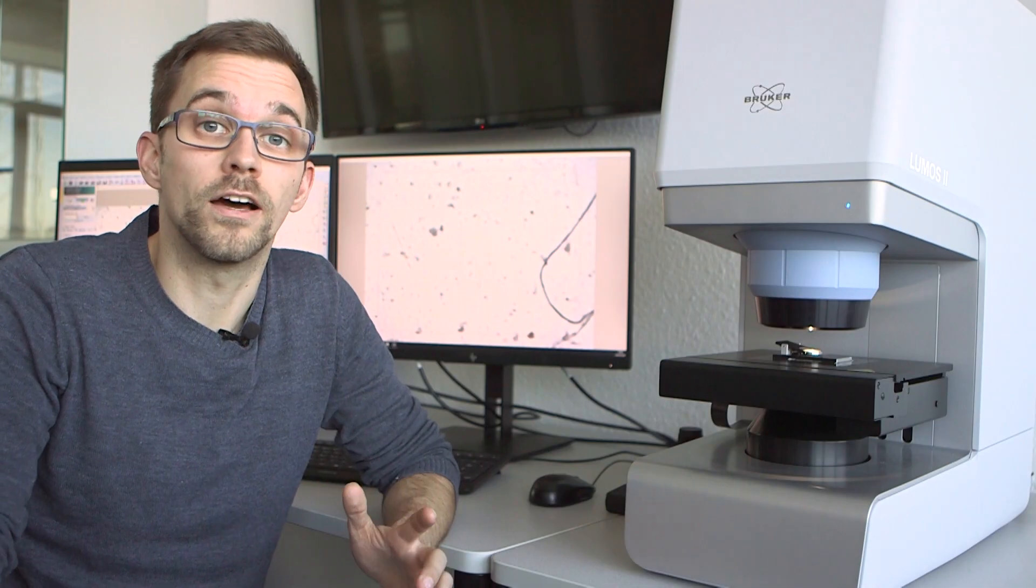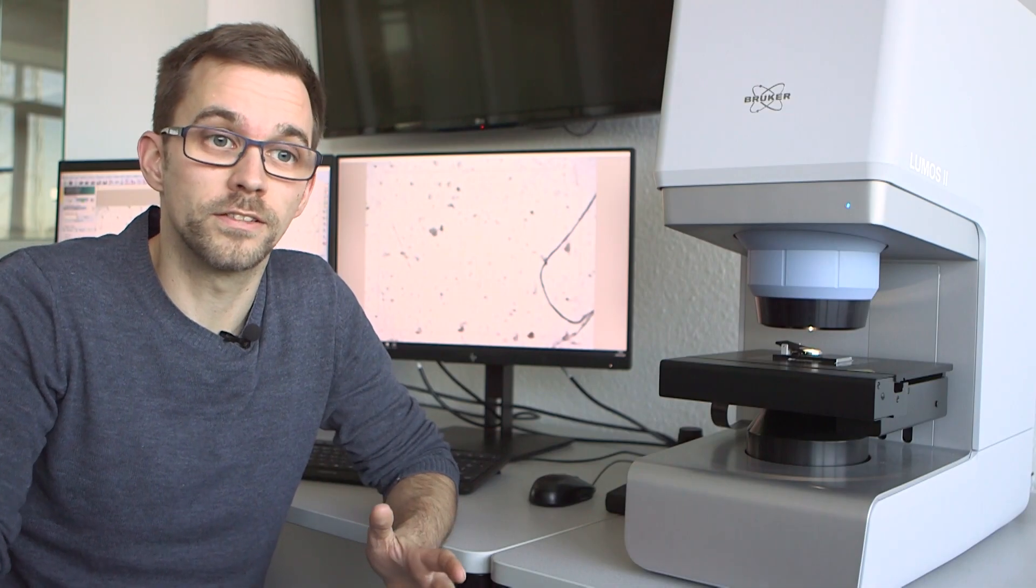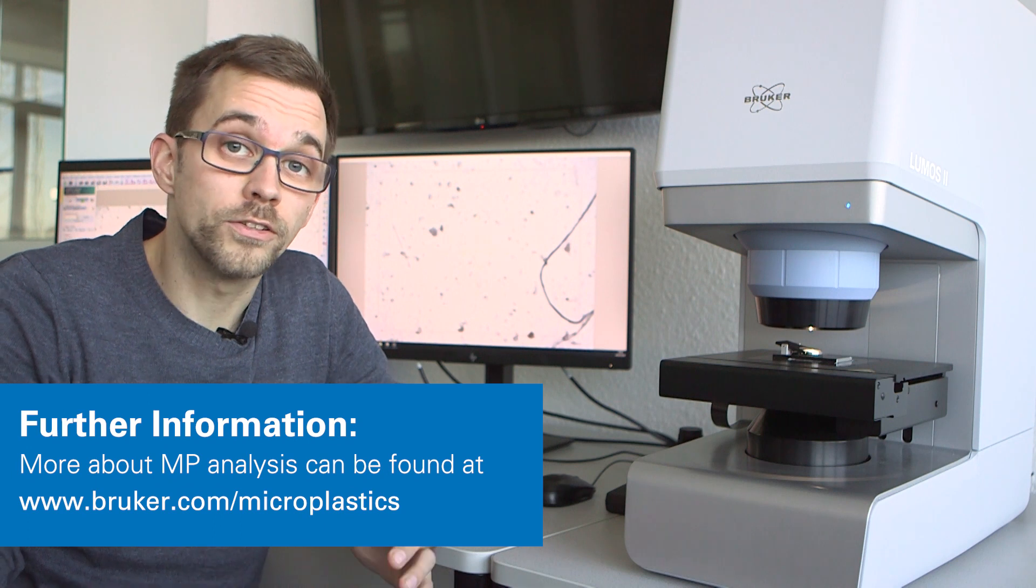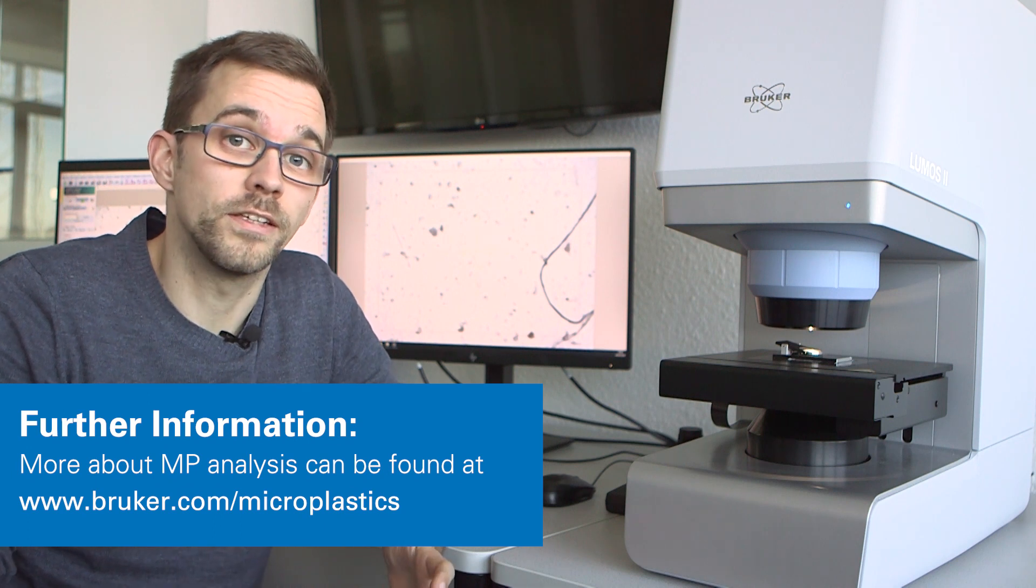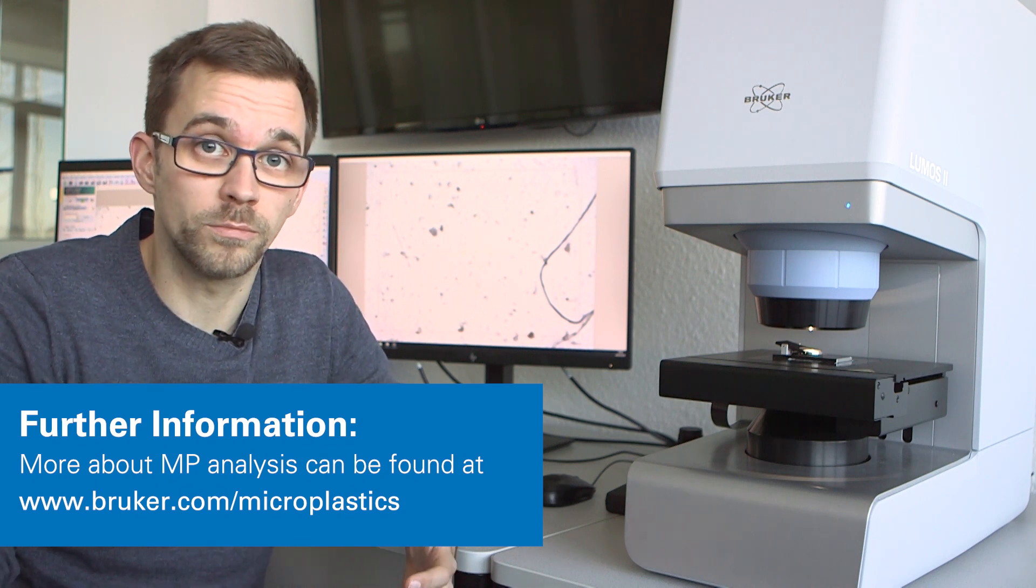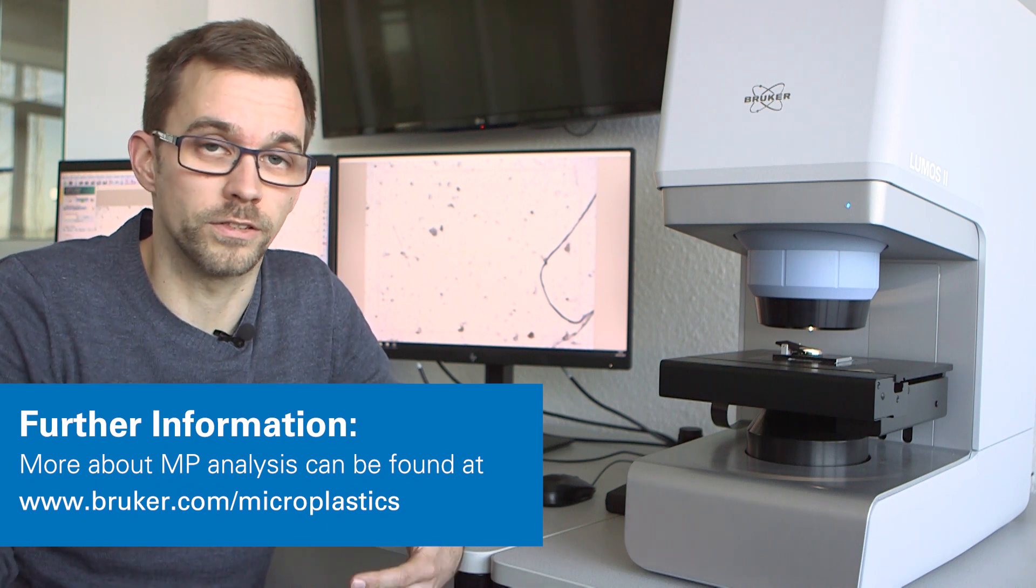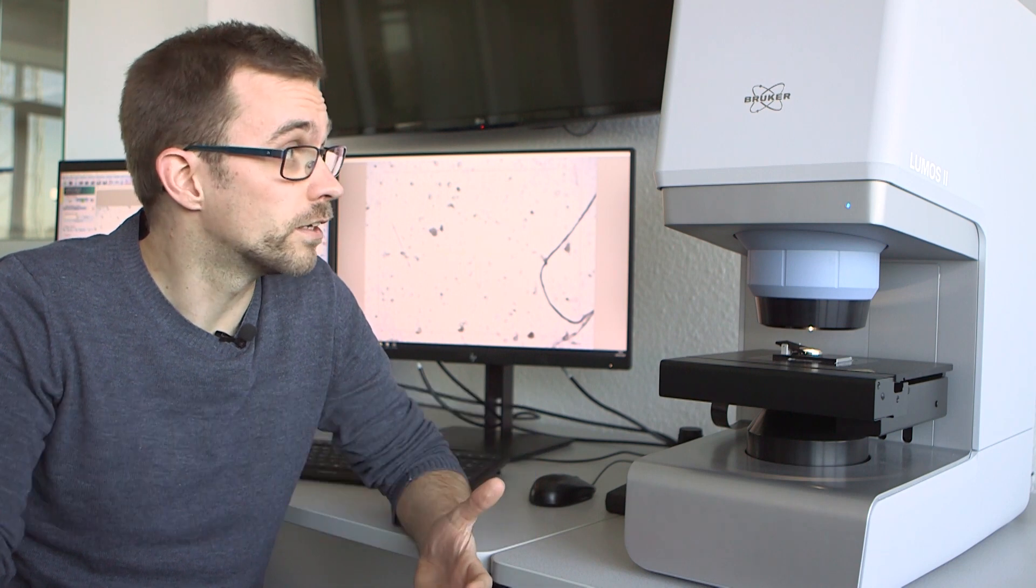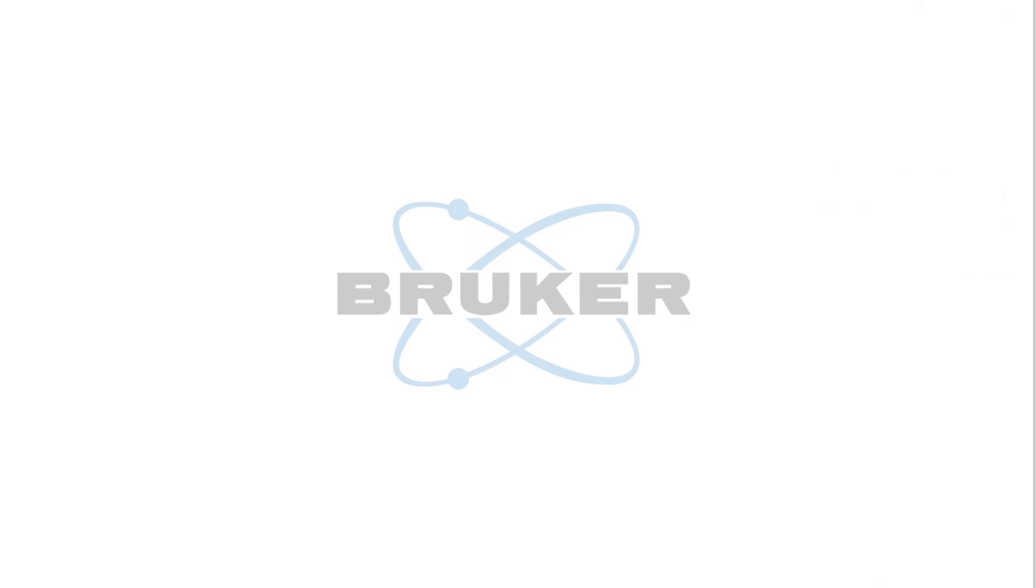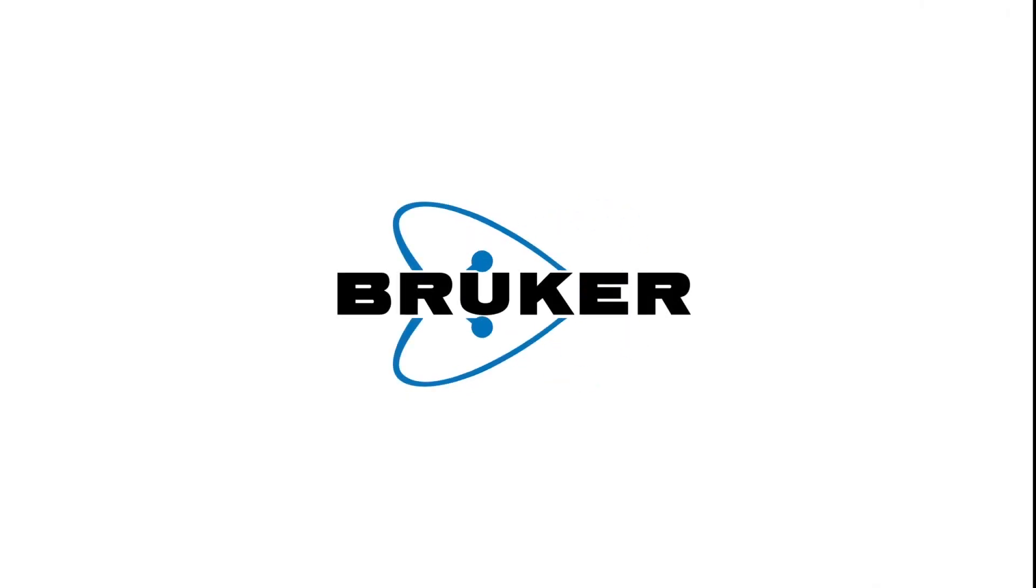Now that we have our statistics, the analysis is done. I hope I could show you how easy and convenient it is to analyze microplastic particles on a filter with the Lumos FTIR microscope and the tools that come with it. Thank you.